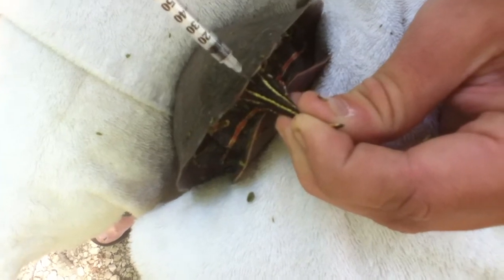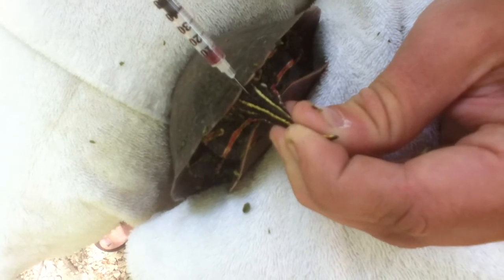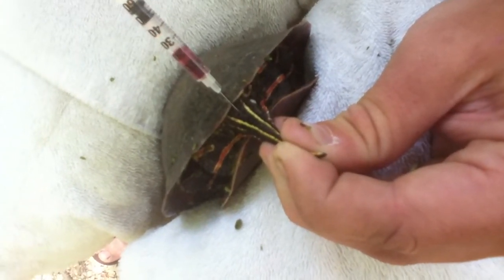My syringe is in, I'm on the backbone. I'm going to pull it up just a little bit and now I'm in that caudal vein. There — I'm in it, I'm getting a good blood flow.